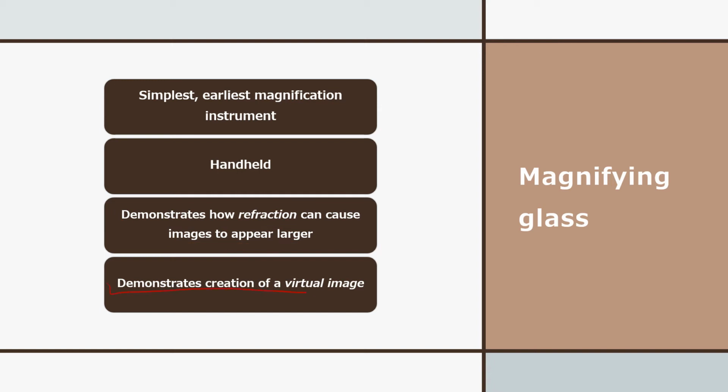This demonstrates the creation of a virtual image. The next set of slides discuss the real versus a virtual image.